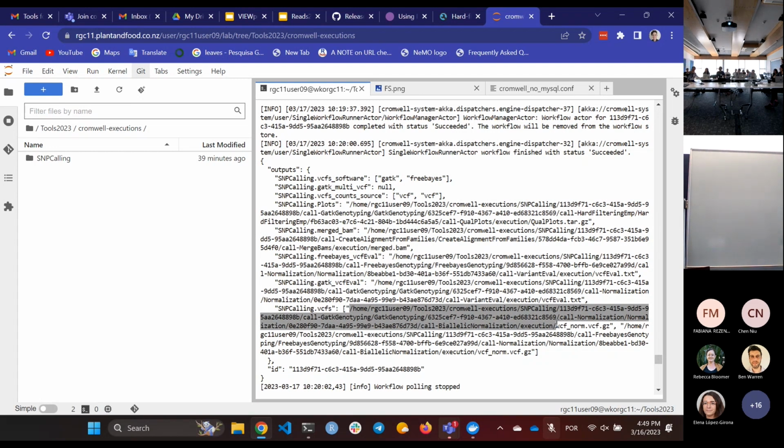So can you specify from where, or will it automatically check? It will automatically check. The database will understand which tasks failed and which were okay, and then it just runs the ones that failed, and all the ones that you changed. If you change some task and then you want to run again, it will understand also. It's like a Makefile, it will understand.